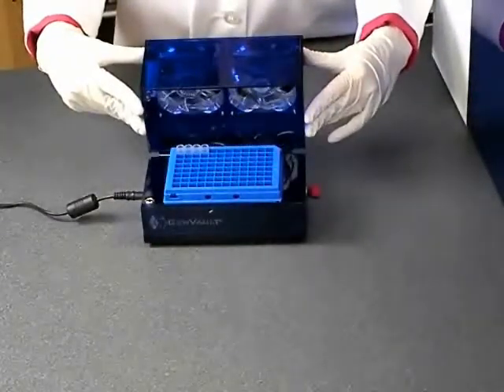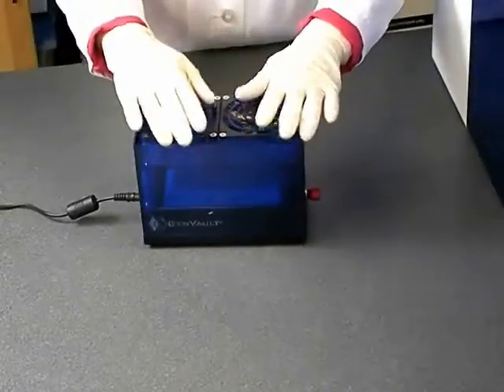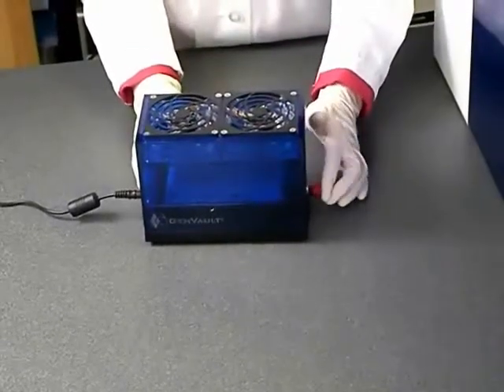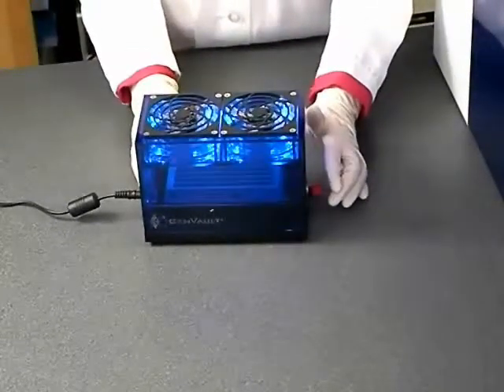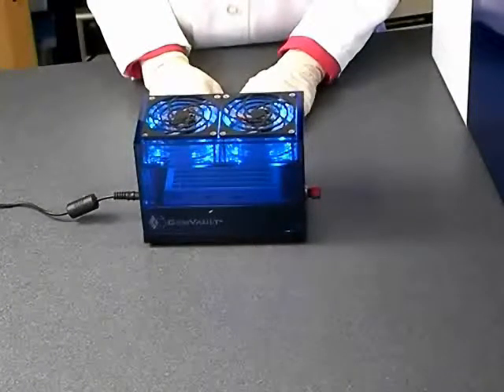After the rack has been placed on the dryer, tightly close the lid of the fast dryer. When the lid is closed, push the button on the side of the fast dryer to start. The dryer will illuminate when the fan is running. Leave your samples to dry overnight in the fast dryer.